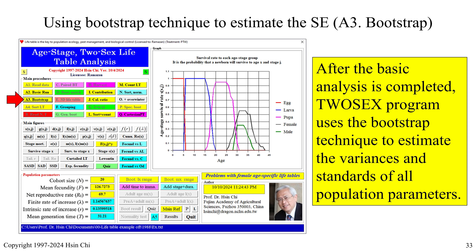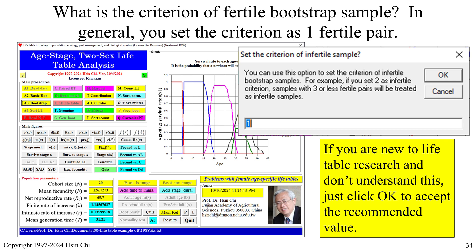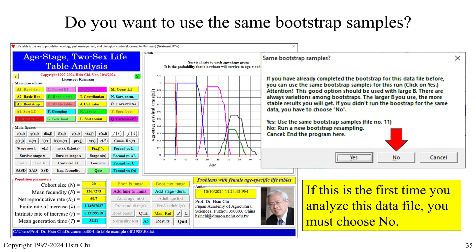After the basic analysis is completed, click on A3 Bootstrap to use the bootstrap technique to estimate the variances and standard errors of all population parameters. The program asks: what is the criterion of the fertile bootstrap sample? In general, set the criterion as one fertile pair. If you are new to life table science, just click OK. For the first run, you must choose No when asked about using the same bootstrap samples.